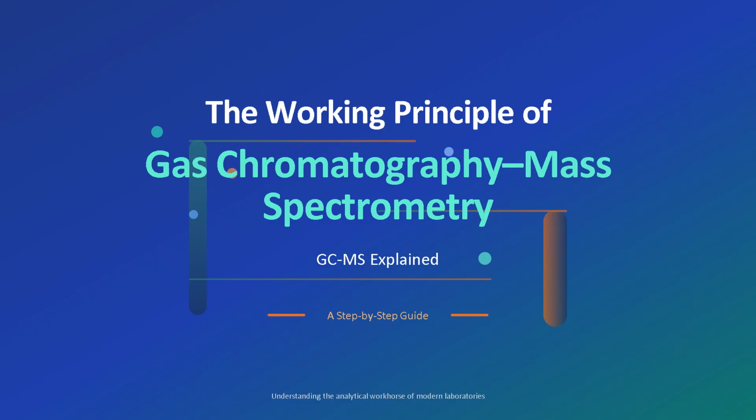GC-MS is often called the analytical workhorse because it can do something very few techniques can: separate complex mixtures, identify unknown compounds, and quantify them with confidence. By the end of this video, you'll not only understand how GC-MS works step by step, but you'll also understand why it is trusted across pharmaceuticals, forensics, and environmental science.